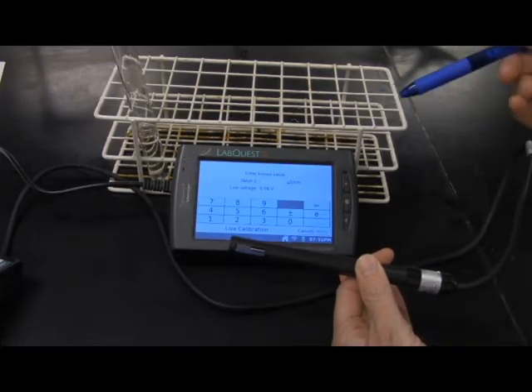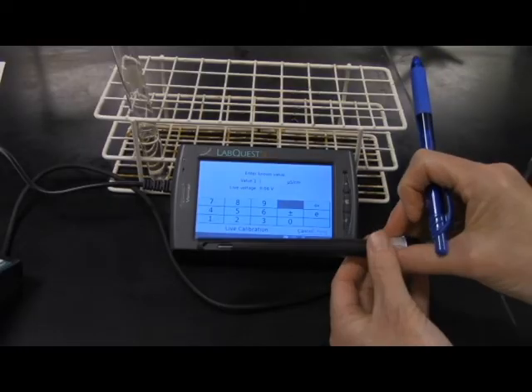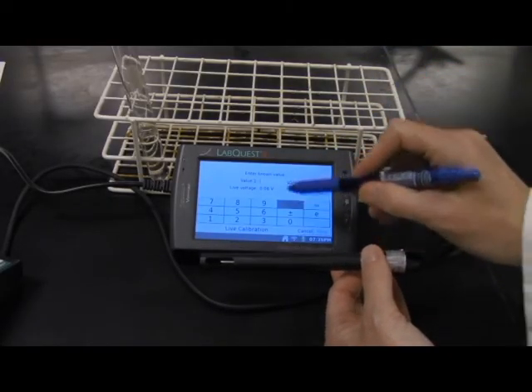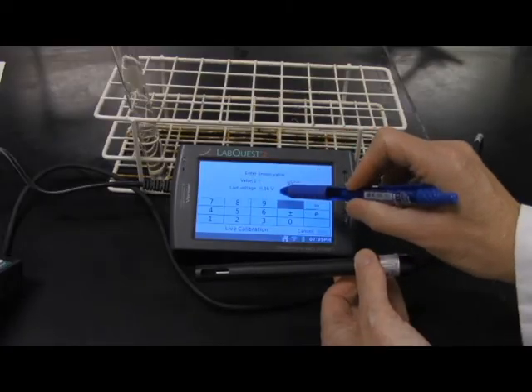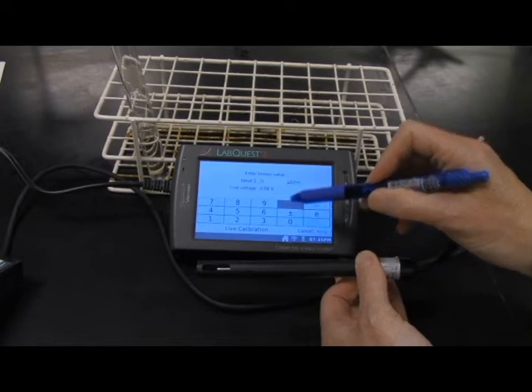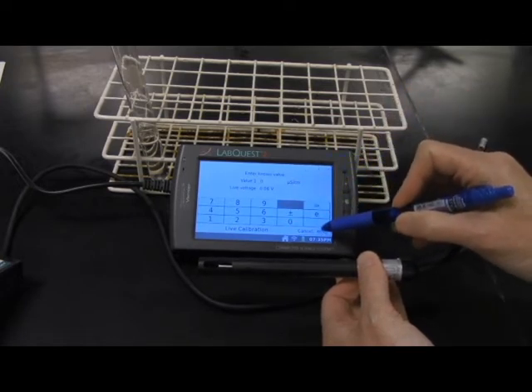We're doing a two point calibration where we're going to say when the probe is in air, it should have zero conductivity, which makes sense. And notice the voltage reading here, 0.06. We're going to enter a zero for our conductivity range and click keep.